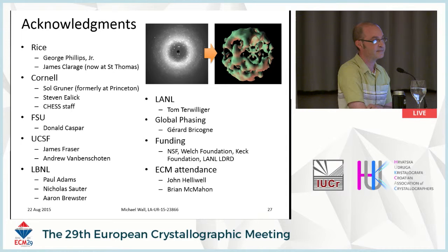that we can obviously calculate the shape using the parallax, I mean, using the various collection, but a spherical detector would be really great for that. And we can manipulate data to use a spherical detector, to present it as a spherical detector. And this is something which could be done, and you could try to process the data from the spherical detector. Yes, I mean from a virtual spherical detector.